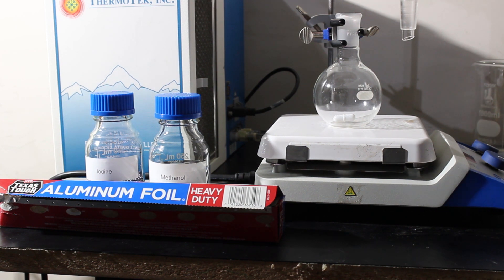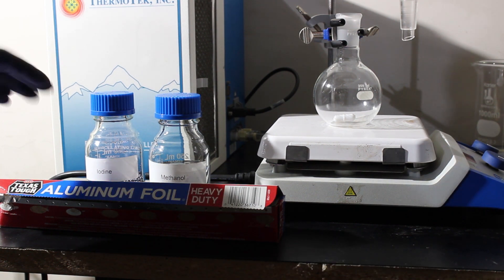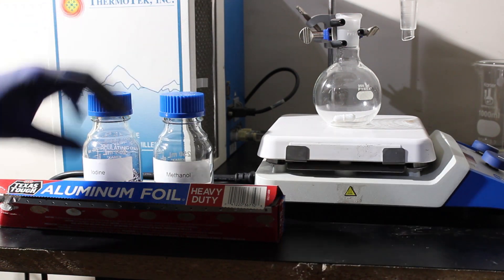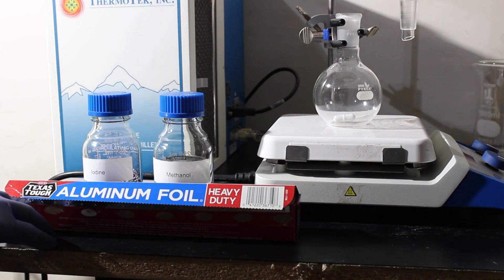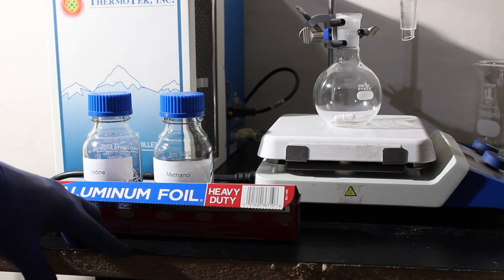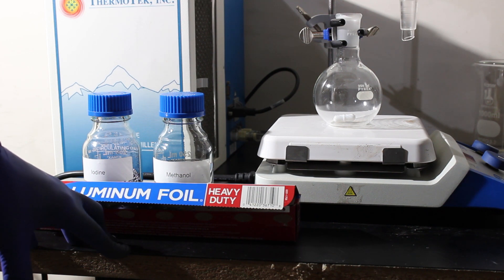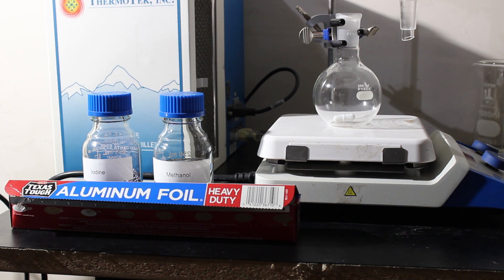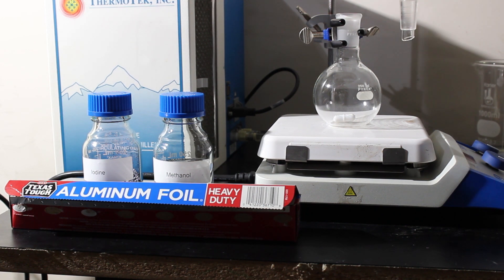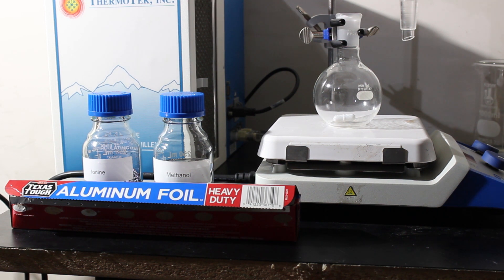The idea is we'll be trying to react iodine and methanol. Supposedly you can use aluminum foil as the catalyst rather than using phosphorus, which is the typical catalyst for this reaction. I'll be measuring out and combining these in a round bottom flask, placing it on reflux for a while, then doing a distillation to isolate the reaction products.